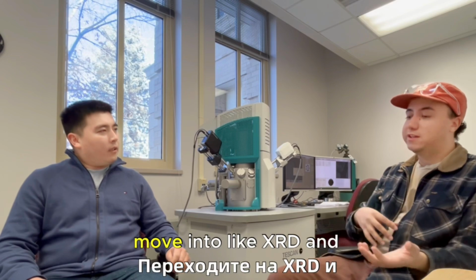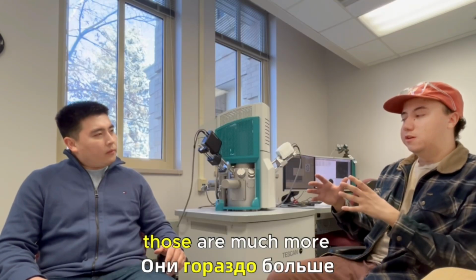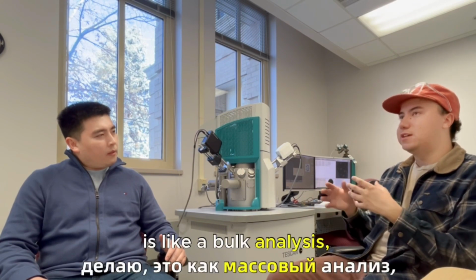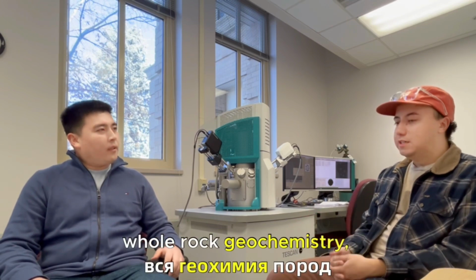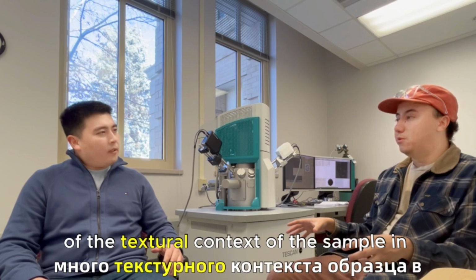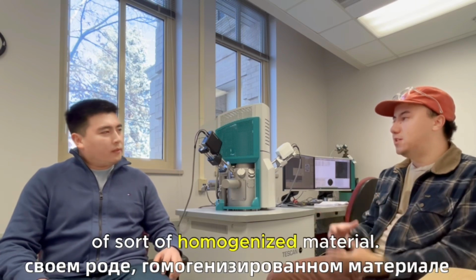And then when you move into XRD and XRF, those are much more commonly referred to, in what I do, as bulk analysis, right? Similar to whole rock geochemistry, in that you're taking away a lot of the textural context of the sample in order to get a representative view of a homogenized material.